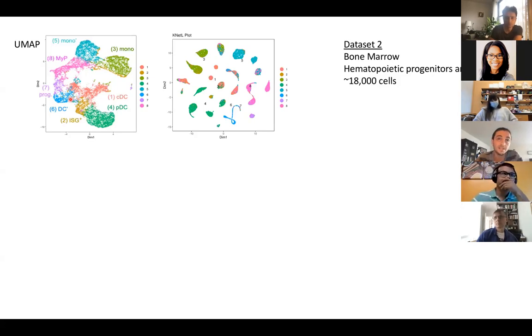For one, because it can be redundant. If you have the RNA transcript data and the antibody tag, it will put twice as much weight on those markers. And we've seen generally that the ADTs can perform quite well also, but we generally stick with just the RNAs because there's more information there. For example, in understanding the heterogeneity in our DC progenitors, most of that heterogeneity is not captured by our surface markers.